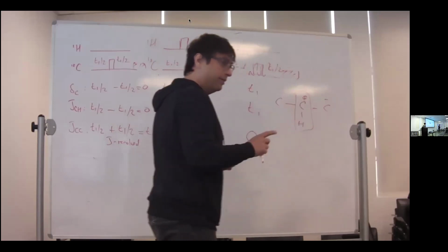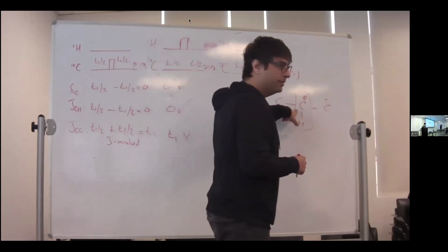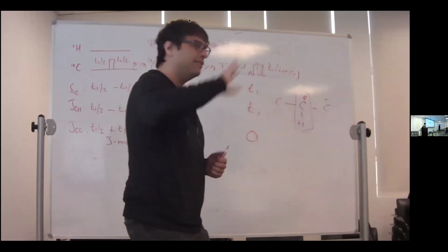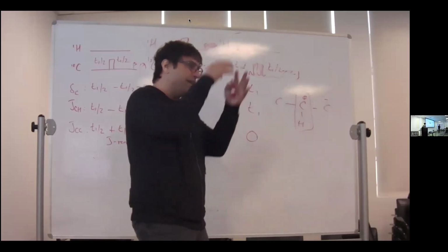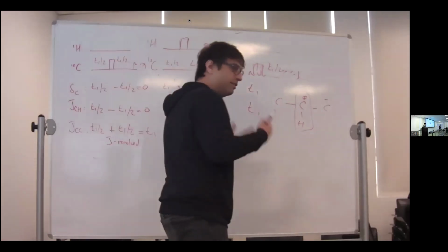There's another one, to get rid of homonuclear carbon-carbon coupling. Is that a nuisance, by the way, especially in proteins? Although you guys have carbonyls which are nicely separated, you can nicely hit them with selective 180, right? Sugars in nucleic acids, they're all within 20 ppm. So the ability to effect selective 180s is a bit harder. So for us, it's a serious problem.